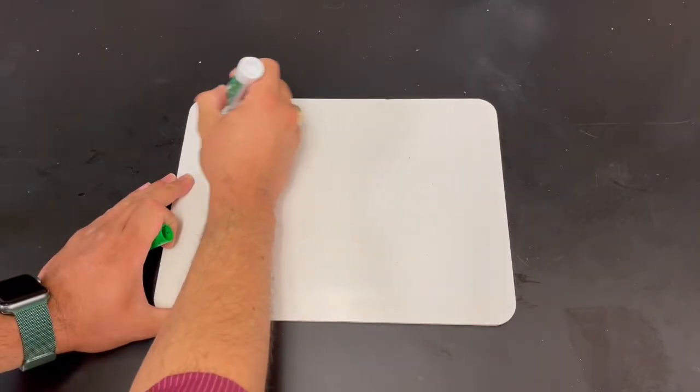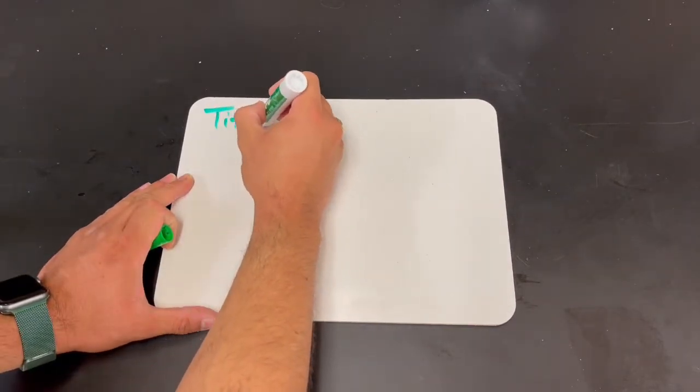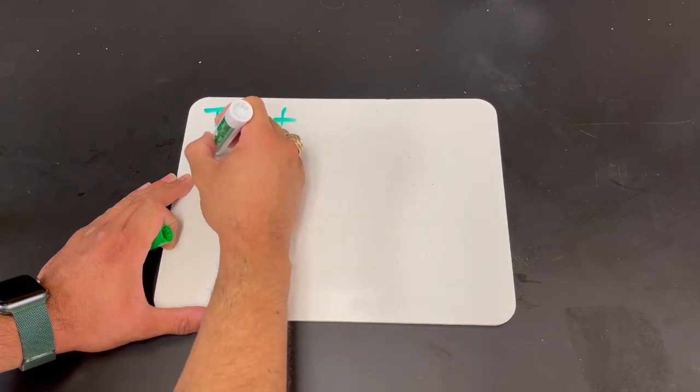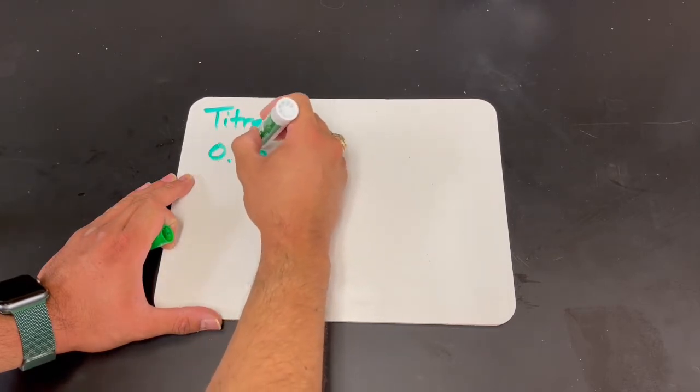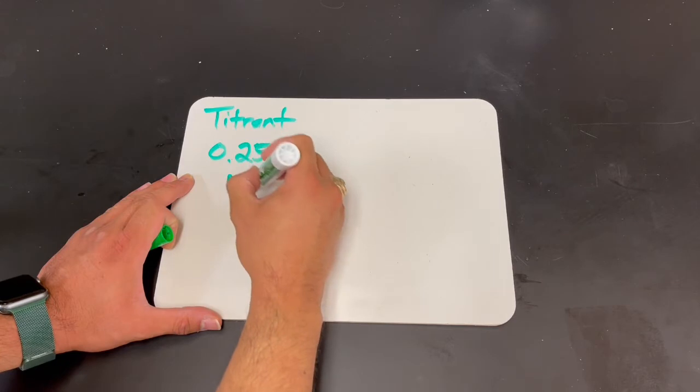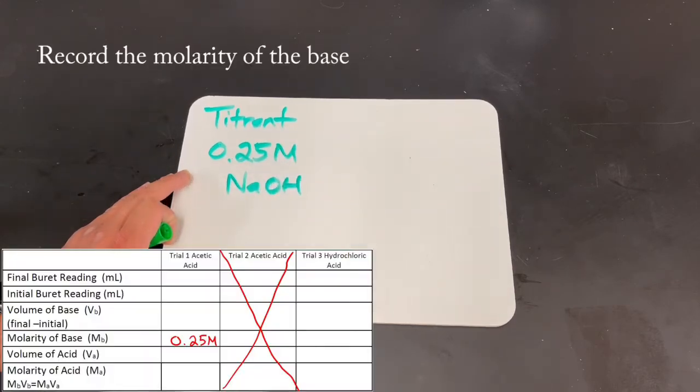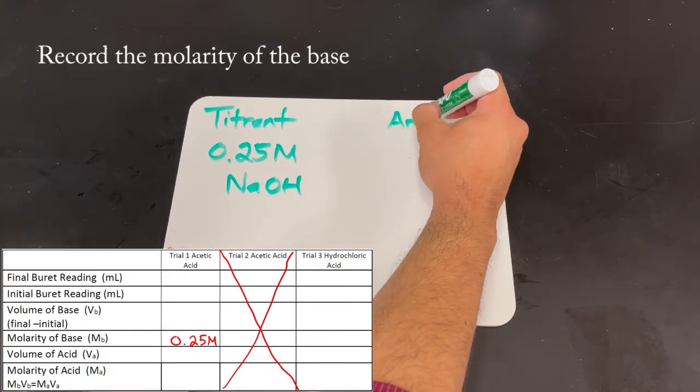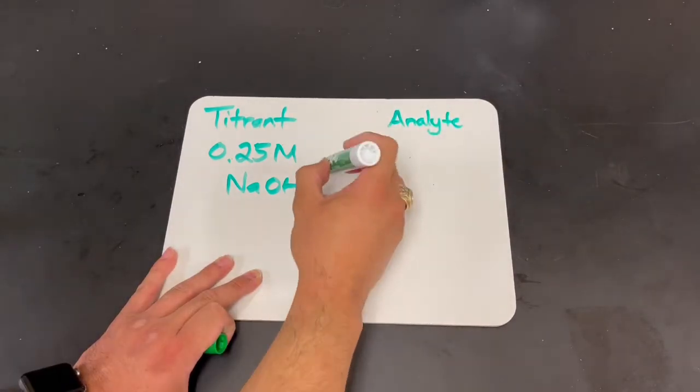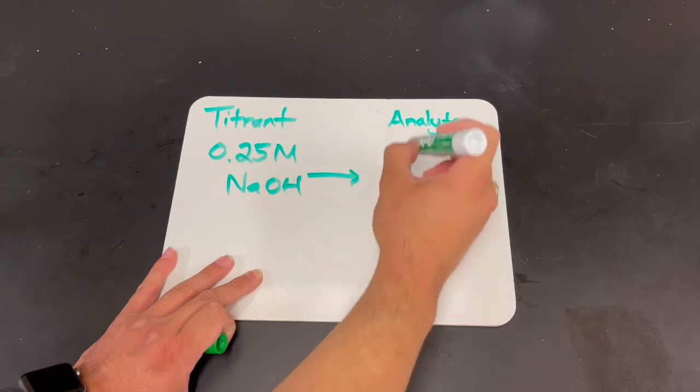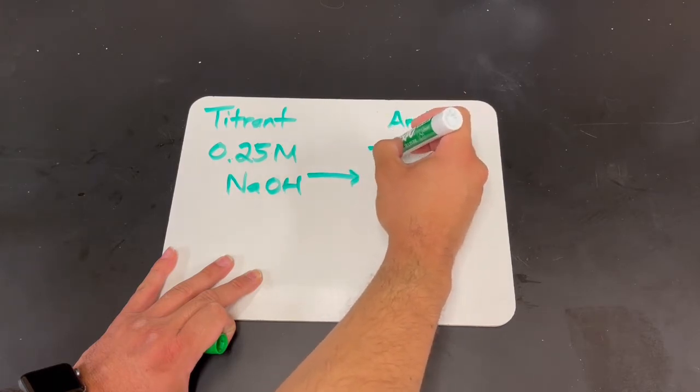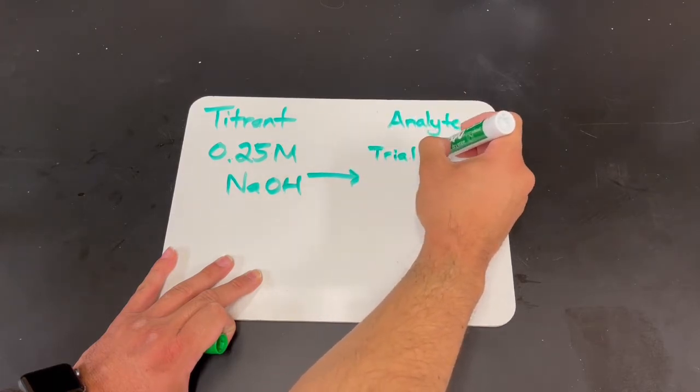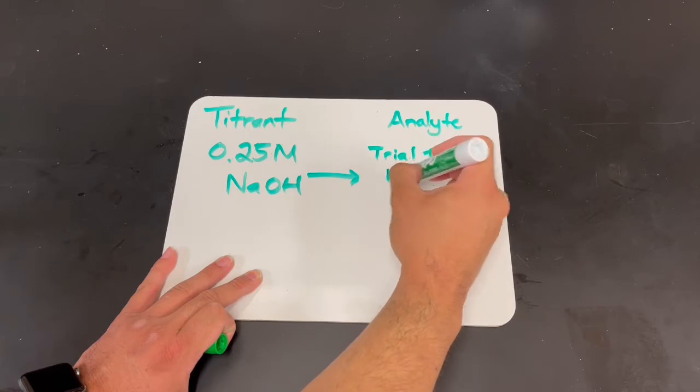So today's titrant would be our 0.25 molar NaOH. The analyte, the one that we don't know the concentration of, we're going to be adding NaOH to, in trial one, acetic acid.